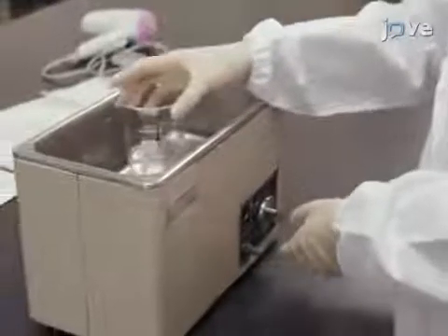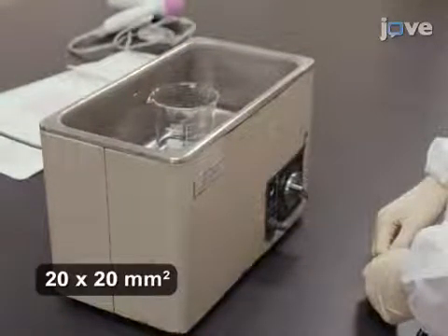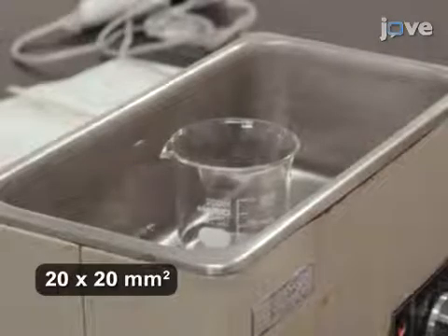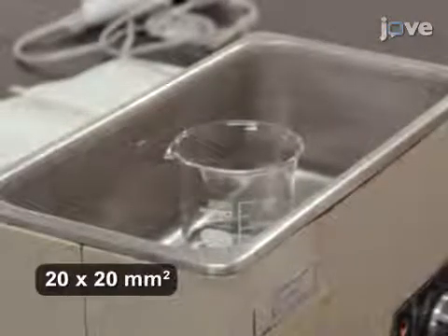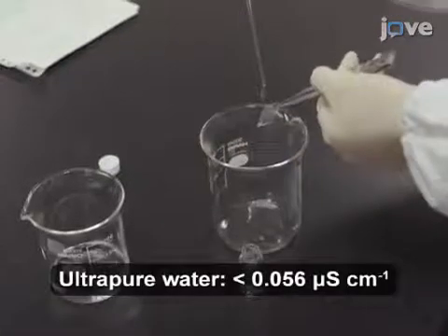To begin this procedure, pre-clean a glass substrate through ultrasonic treatments using an ultrasonic cleaner containing 1 molar aqueous sodium hydroxide for 30 minutes. When finished, rinse the substrate with 5 to 10 milliliters of ultrapure water.